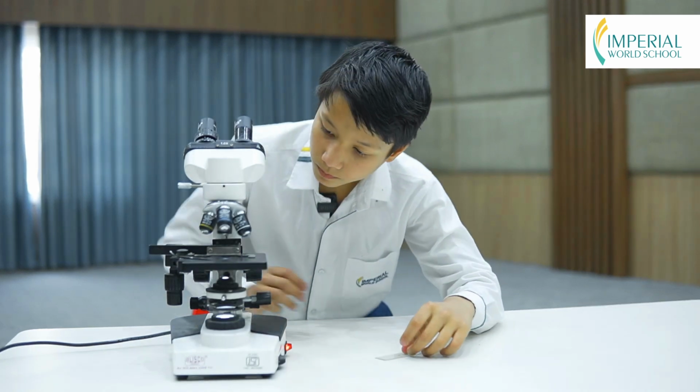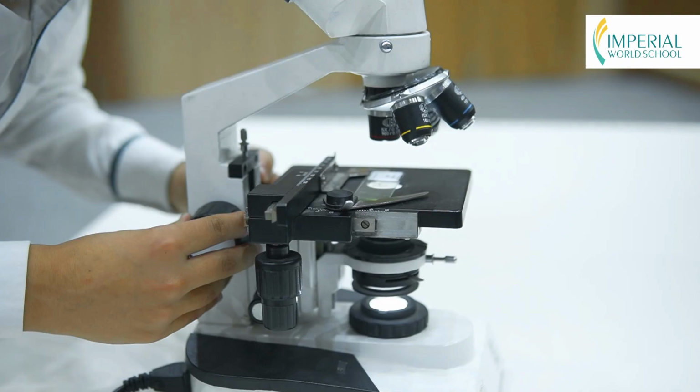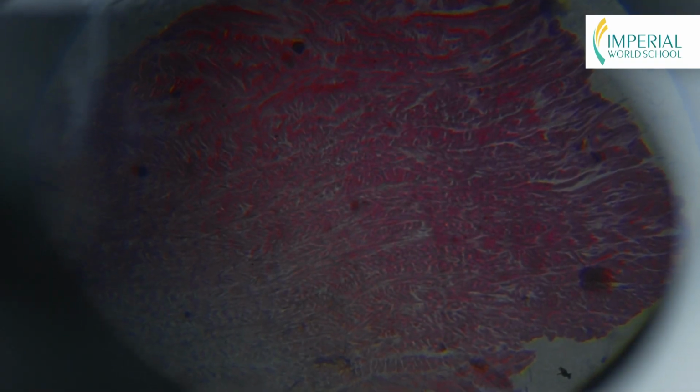As you can see here, I have a permanent slide of animal cell. Now I am going to show you how to focus it in the microscope. Here you can see the focused part of the animal cell.